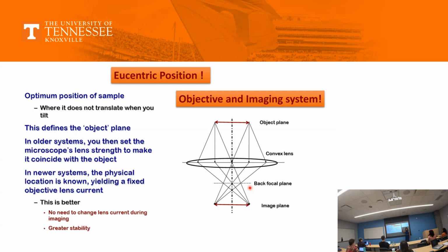So what you clearly see, you open the microscope, you have a screen, and what you see is a dark, or not a very sharp image. So the number one reason for that is that your sample is too thick. The number 2 reason, one of the most common reasons that students have, is that they do not adjust the eucentric height. Eucentric height is one of the most important alignments.